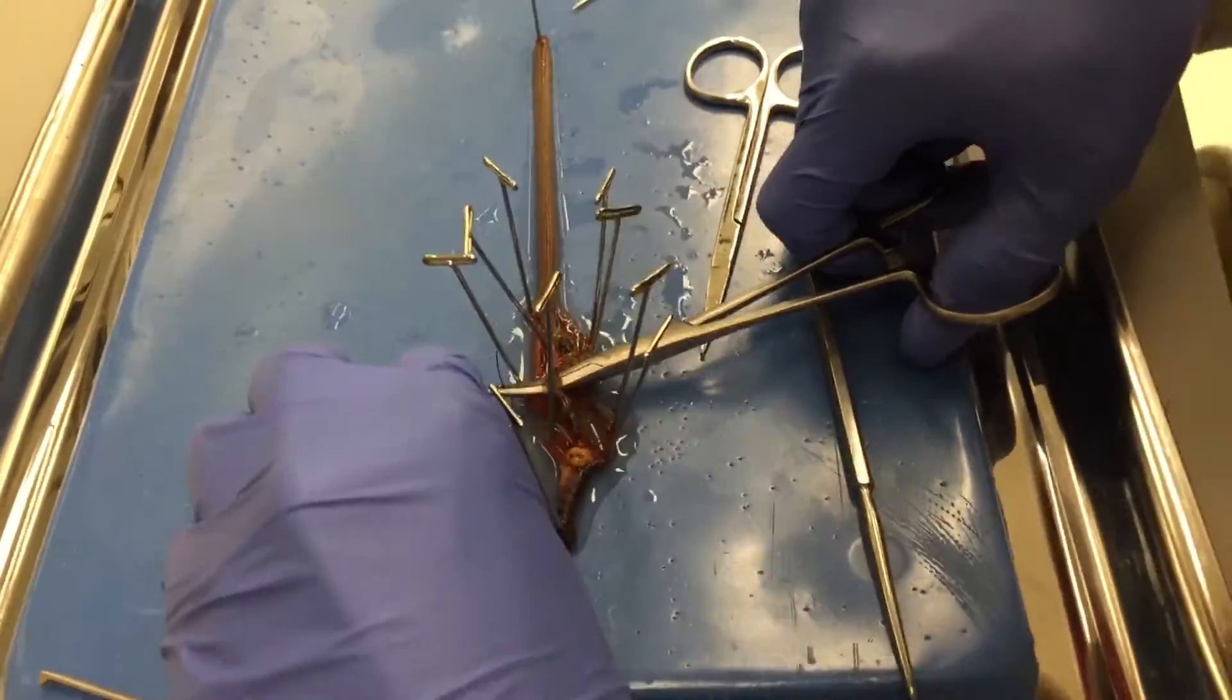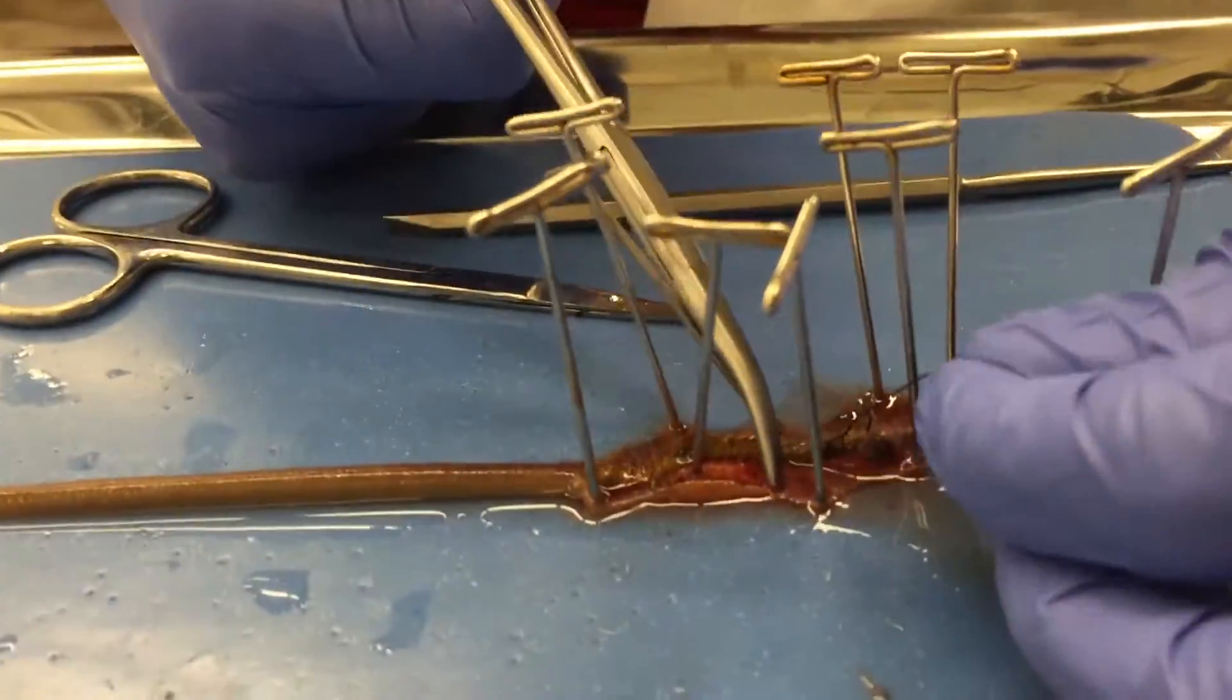Using the hemostat, take the suturing wire and tie it around both sides of the crop and gizzard.